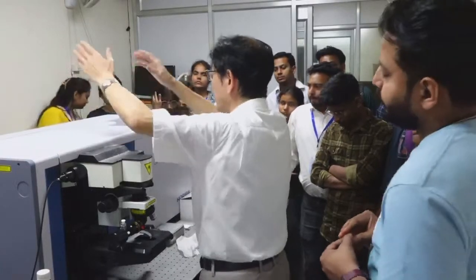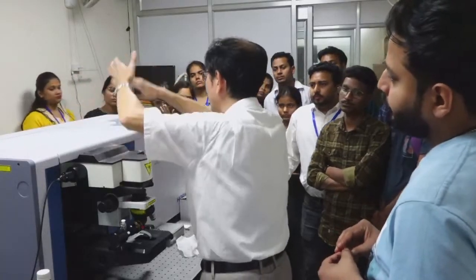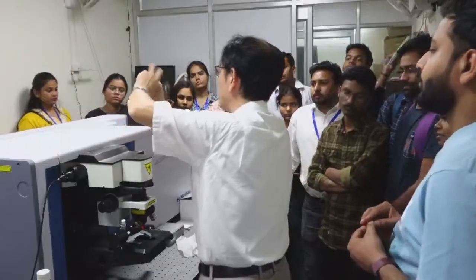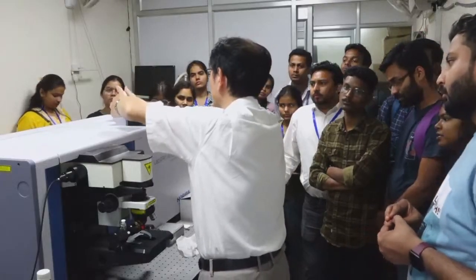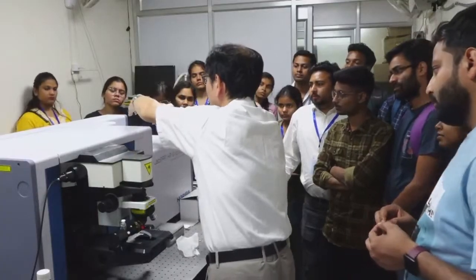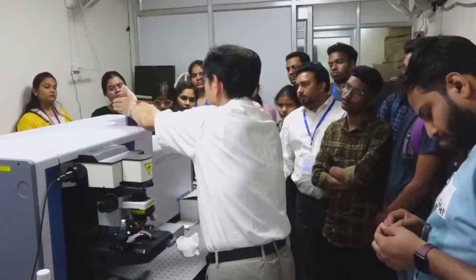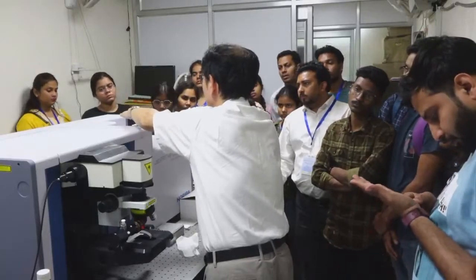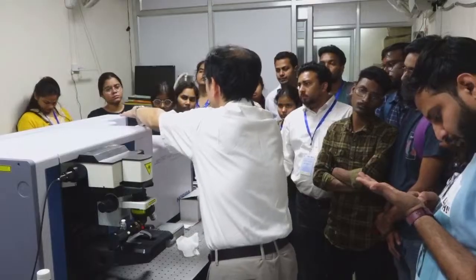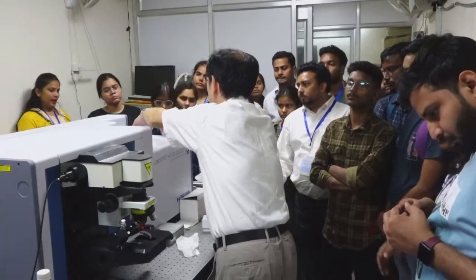But anyway, by separating the Raman signal from the excitation laser beam, the mixed Raman signal is introduced into the monochromator. Then the monochromator includes the grating. Then the grating separates the mixed color into each wavelength. Then the separated wavelength is detected by this CCD detector.